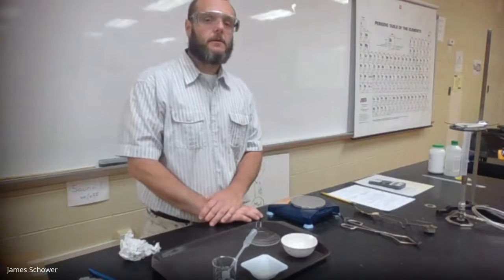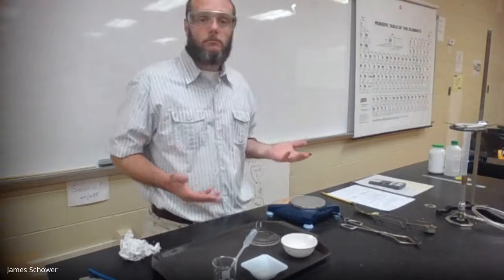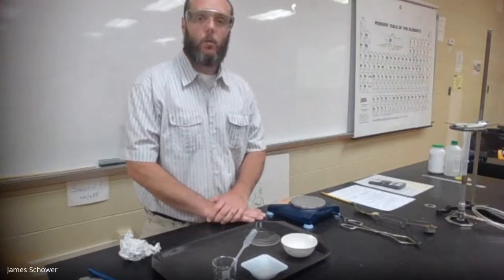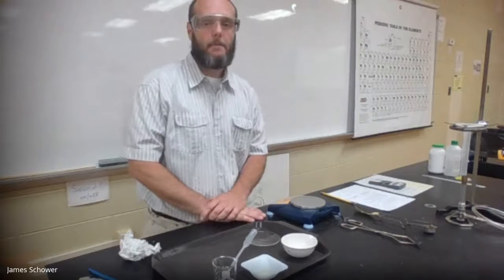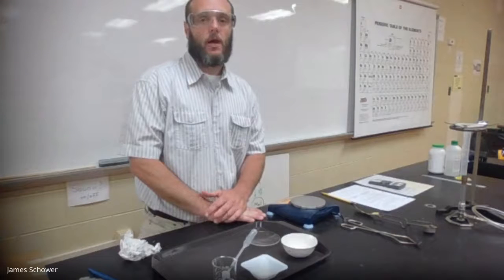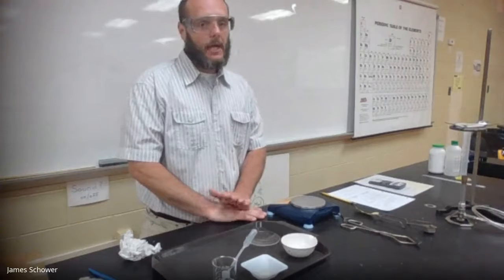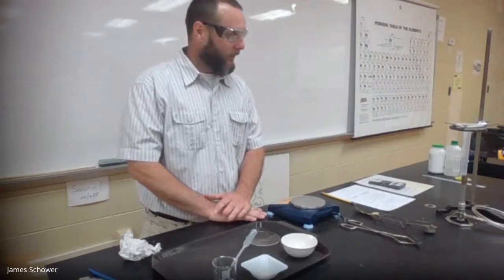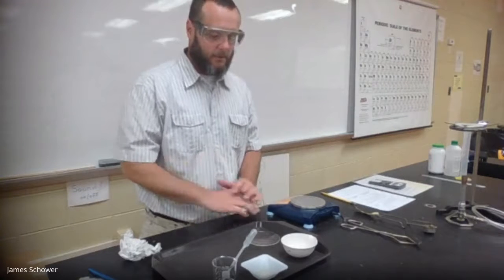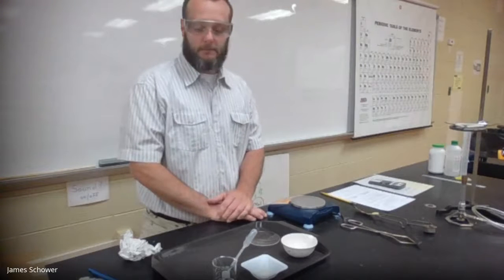Now, we learned in the past in the mixtures chapter that we could separate salt and water by evaporation. So that's what we're going to be doing in this lab. The cool part about this lab is that we can actually, on paper, calculate the mass of sodium chloride we will produce in lab. It's one of my favorite labs to do, hands down. A few simple tools we need: balance, evaporating dish, watch glass, crucible tongs, Bunsen burner, clay triangle, ring stand.